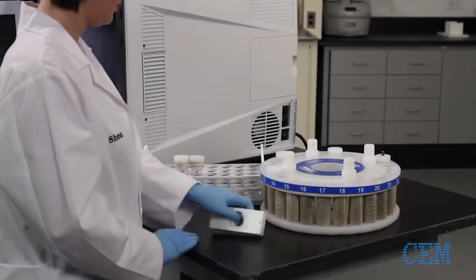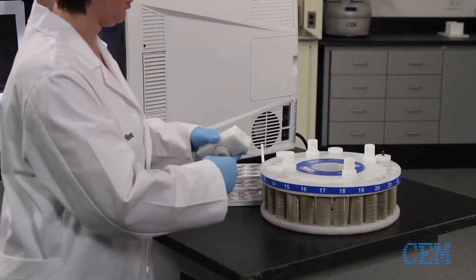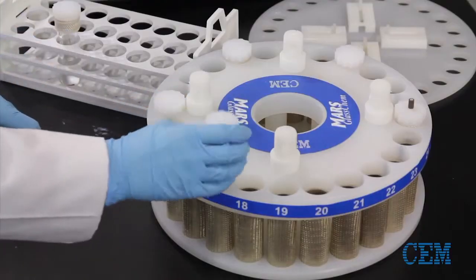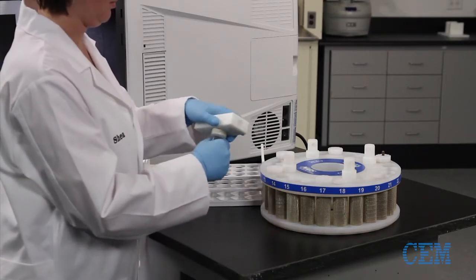To begin preparing the carousel or turntable, insert the vessels into the sleeves which should already be installed in the carousel. Using the preset torque tool, tighten the top of each vessel until the tool makes an audible click.